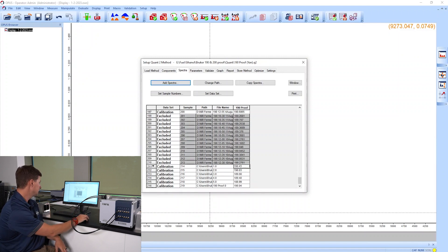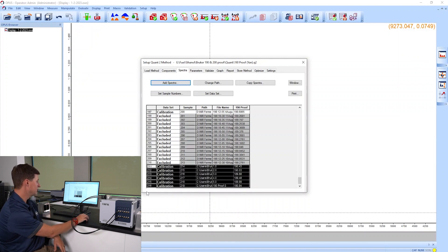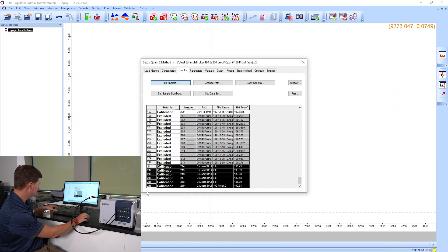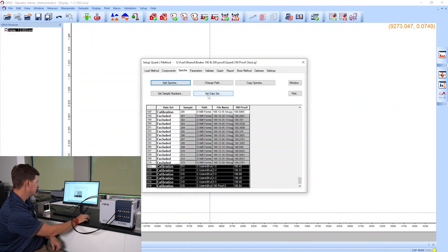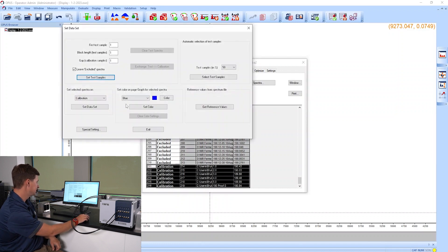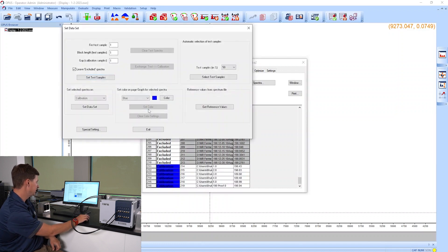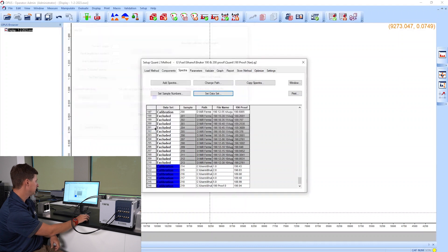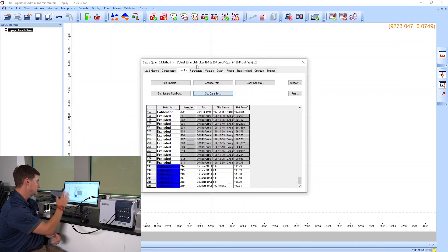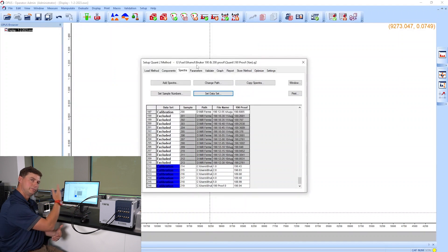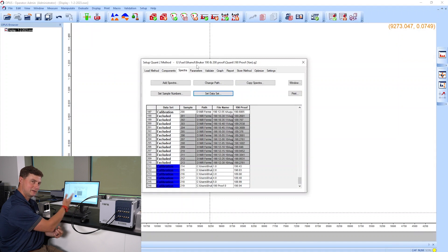I'm going to make all these samples a different color so we can see where they show up. So benchtop calibration, process spectra added in there plus the reference spectra.